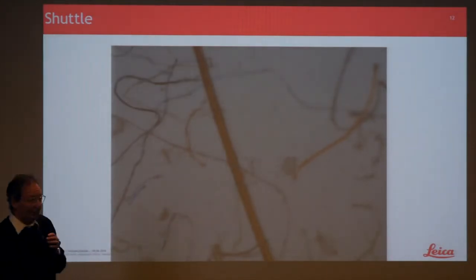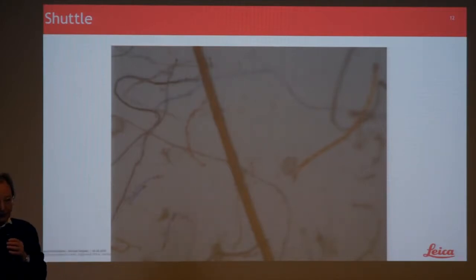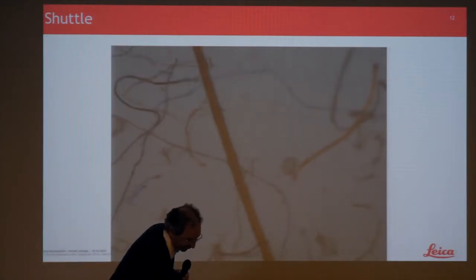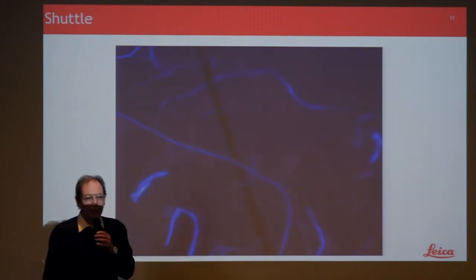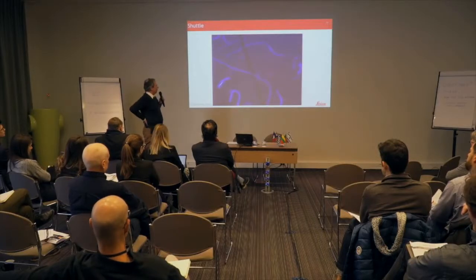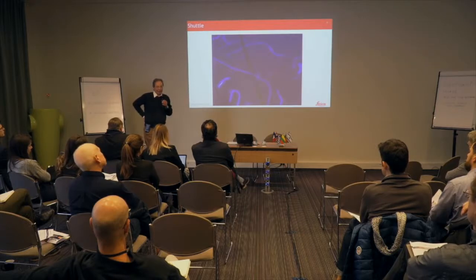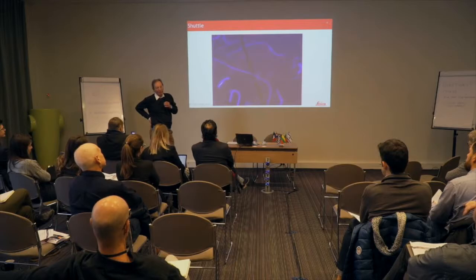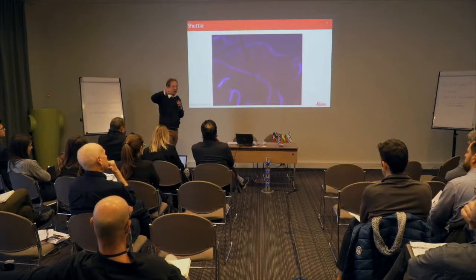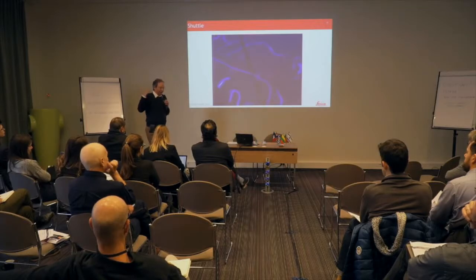So here again, you have a part non-polarized light, and that's one single shot out of that scan that we had before. And we've tried something that I cannot talk about, but what you get out of that is that kind of image. So we were actually using something that we just tested for another purpose to get a fluorescence effect. But this is not classical fluorescence with a cube where you have an excitation and an emission filter.